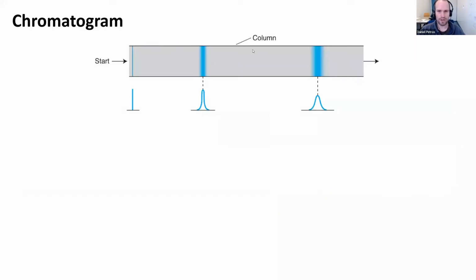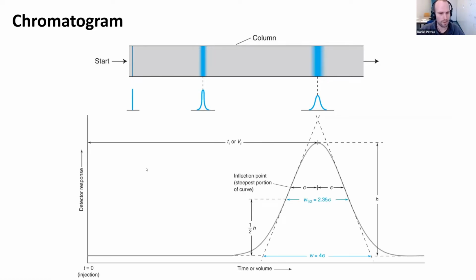All right, so talking about peaks a little bit. A peak is basically the signal intensity of a molecule that elutes at a certain time, and it's the same thing as a band in thin layer chromatography, just that you have this intensity dimension. If we plot this, we get intensity over the time or volume of my separation, and then hopefully you get a very nice Gaussian distribution in a nice chromatographic separation.